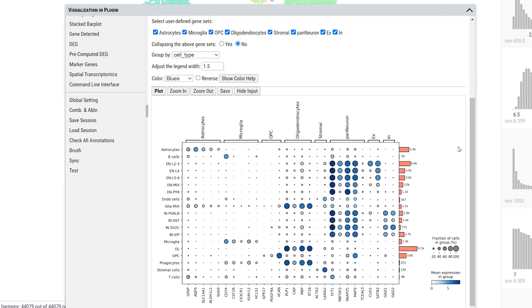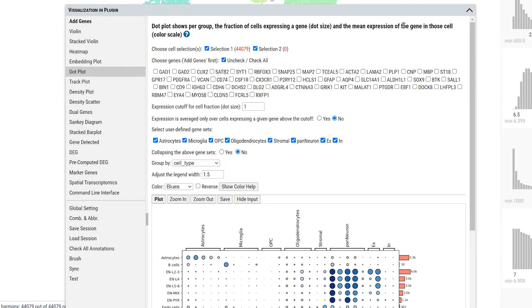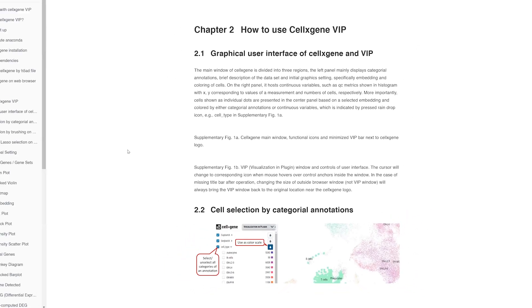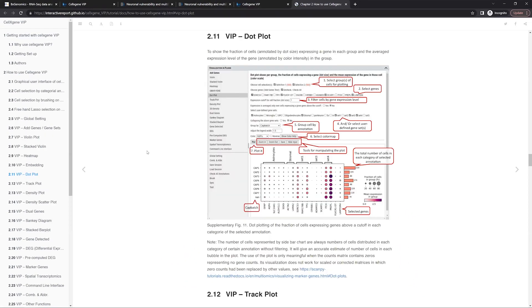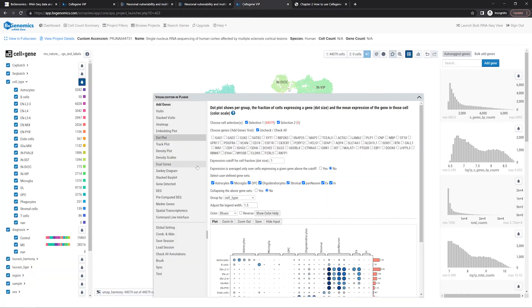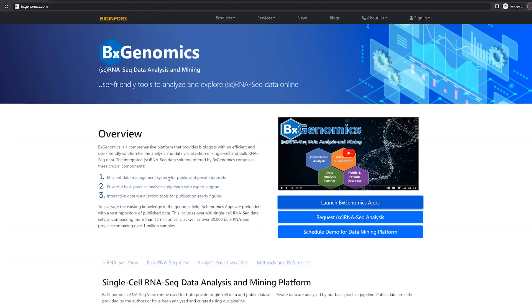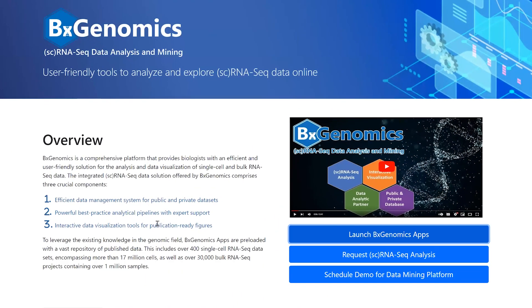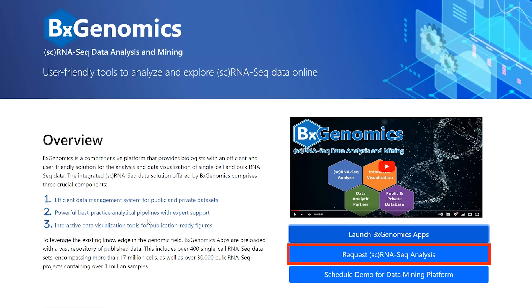All tools in the VIP window have detailed help information — simply click the question mark to open the help page. Today, we demonstrated several key visualizations using Cell-by-Gene VIP. This tool offers over 20 popular plotting functions and analytical methods for single-cell research. We invite you to explore this tool on bxgenomics.com using public datasets. If you need assistance with preparing your own single-cell data for visualization, please don't hesitate to contact us. Thank you.